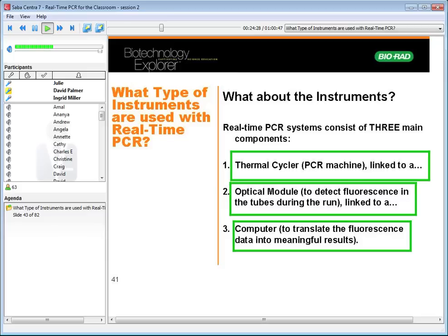So just to kind of reiterate, teaching real-time PCR in the classroom actually is really easy. You can use the crime scene kit with the starter package or the GMO Investigator starter kit for real-time. If you're doing your own PCR, say you've been teaching PCR using your own primers, you can just substitute a SYBR Green supermix for your Taq polymerase and run it on a real-time instrument.